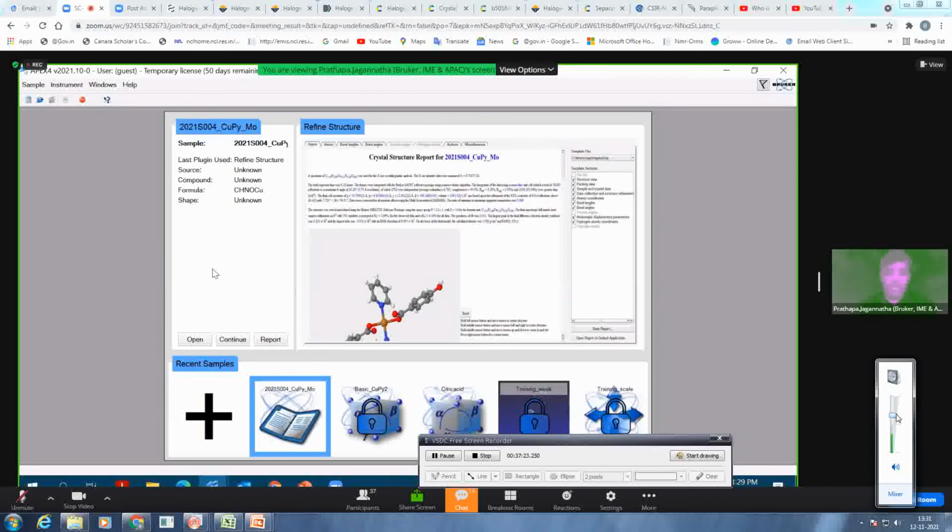Okay. Thanks, Kenji. So now the next step is I want you to go through simple data sets by exploring the other features of Apex 4 which have been added now. As I told you, as soon as I open Apex 4, it shows you a welcome screen. It's not an empty gray area now.